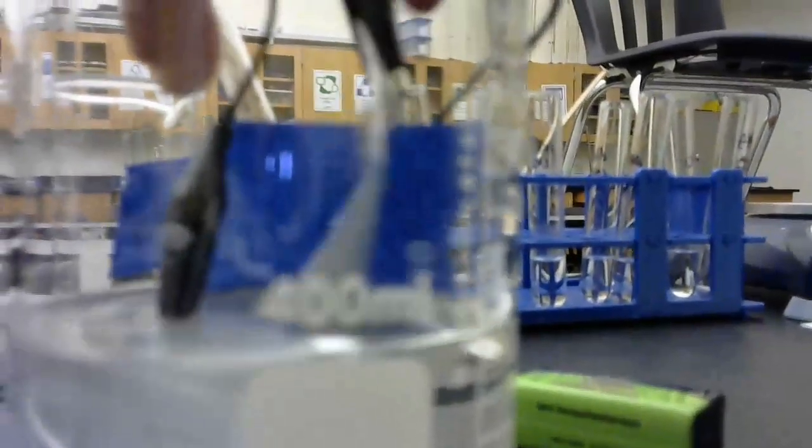Okay, so when I stick it into my water, all of a sudden I start to see tiny, tiny, tiny little bubbles that are being produced at the bottom of the aluminum foil. So if you look really carefully, okay, you can see these tiny bubbles coming from the bottom of the aluminum foil.